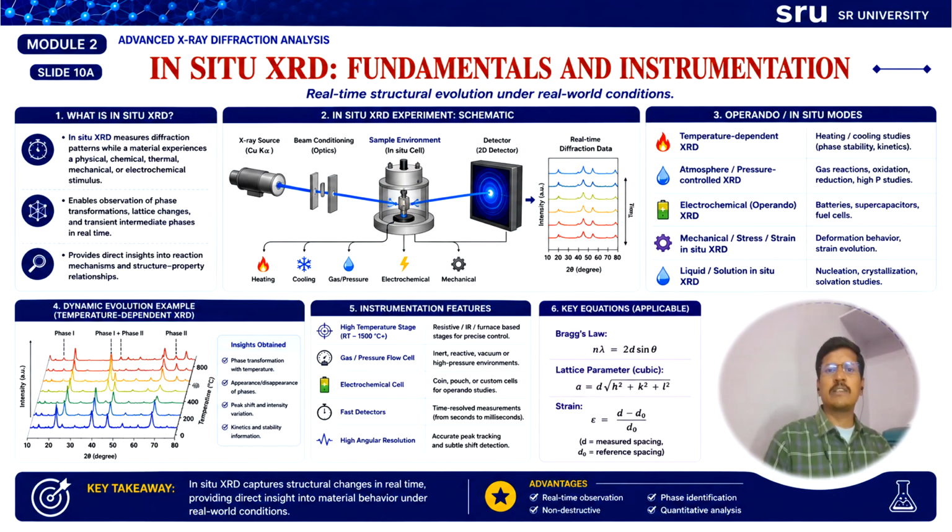In situ XRD allows us to monitor the structural changes in real time under actual operational conditions. This is extremely important because materials often behave differently under real working environments compared to static laboratory conditions.